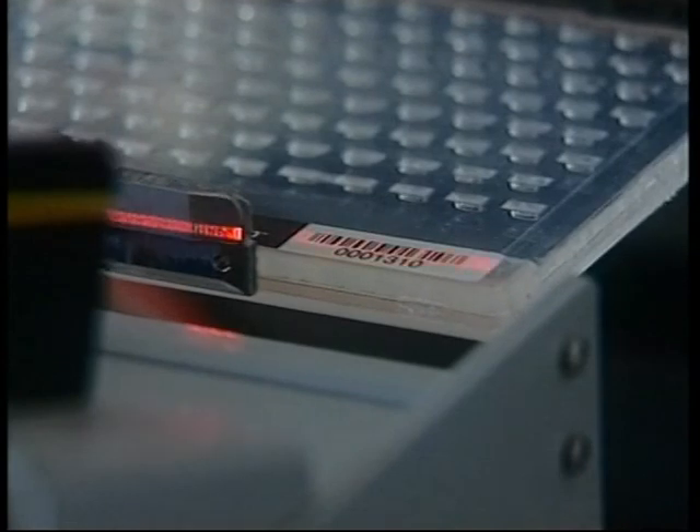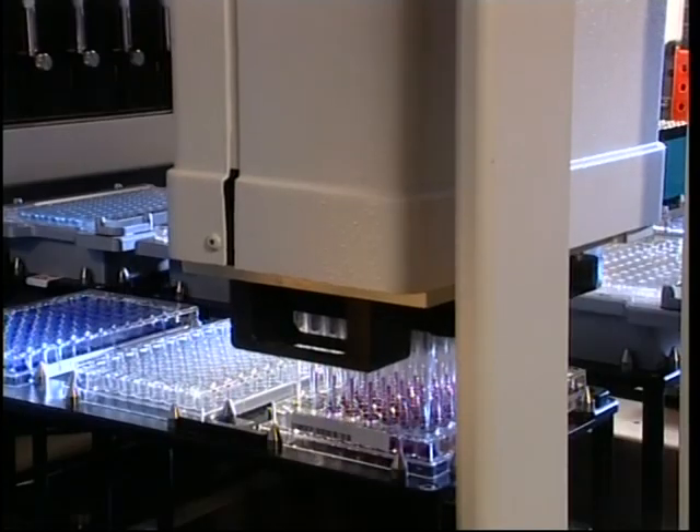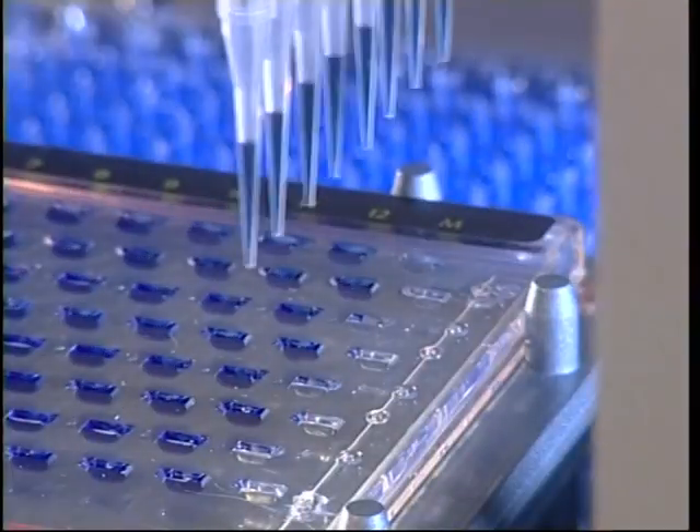ePage cassettes may be handled and loaded on automated dispensing robots. Using either the eBase or the dedicated eHolder, both 96-span and 8-span heads use the unique criss-cross design to load samples and markers.